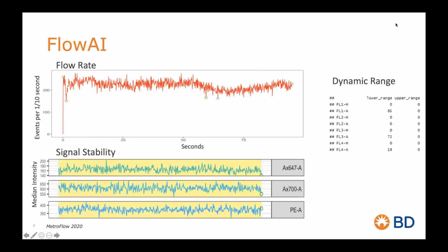And what gets left is just a gate called good events. And you start your work from the good events portion. Data quality checked, at least for that sample across time. And I'll show you in FlowJo that it's a groupable action, so you can apply it to all your data just by drag and drop.